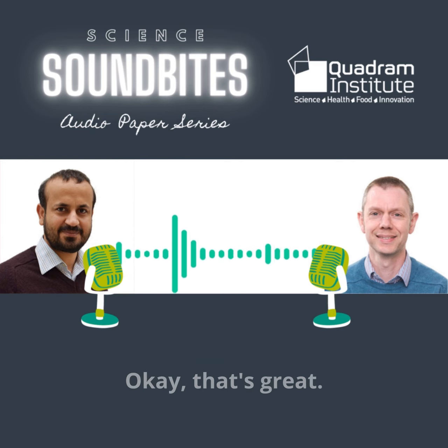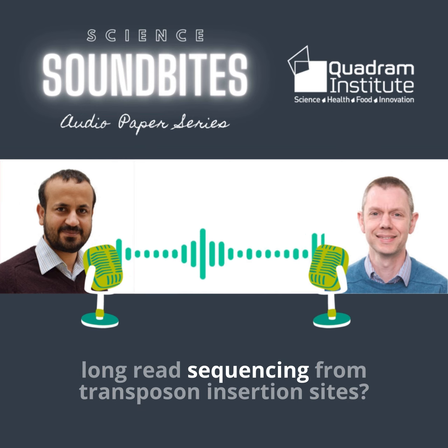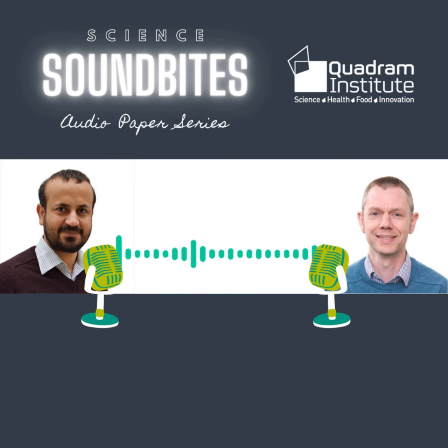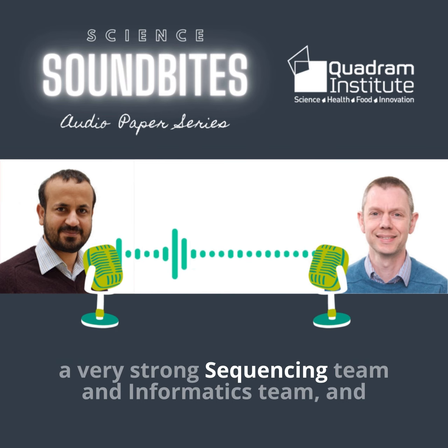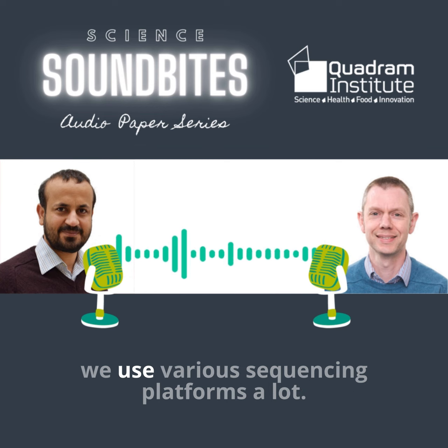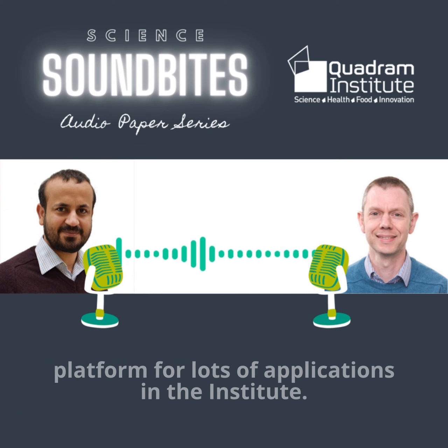Okay, that's great. So how did you plan to do this long read sequencing from transposon insertion sites? Okay, so we're very lucky at the Quadram that we have a very strong sequencing team and informatics team, and we use various sequencing platforms a lot. And we use the Oxford Nanopore long read platform for lots of applications in the institute.